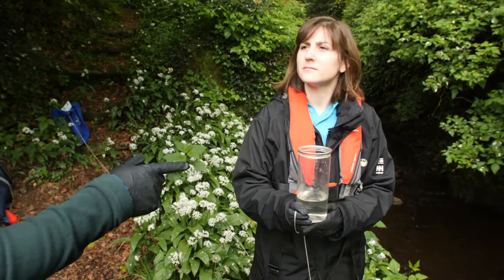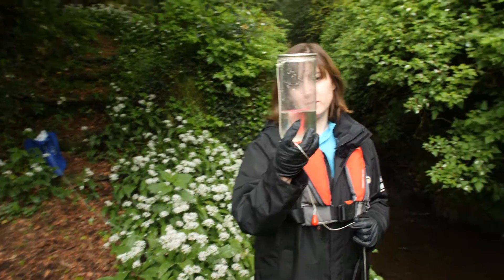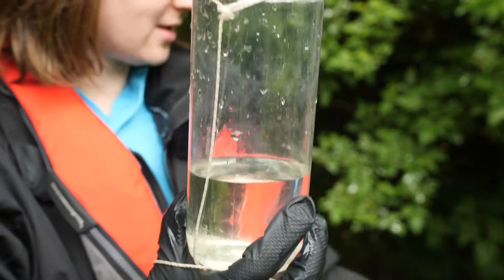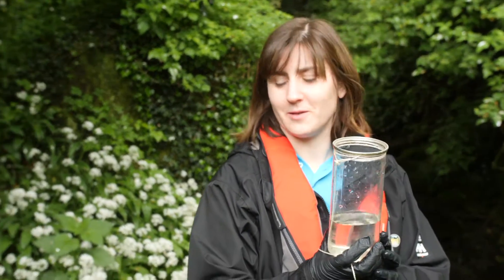This water looks quite clean — quite clear — but that doesn't mean that there mightn't be nutrients in it. A lot of the silt is caught up in the actual algae; it's kind of holding on to it.